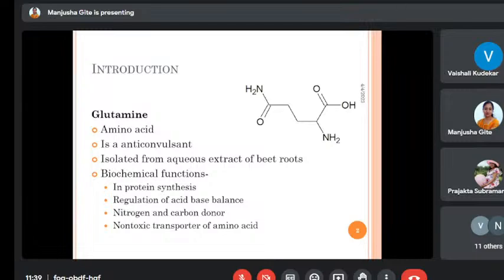In secondary amine, there is only one H, so you will get a singlet. In tertiary amine, there is no proton, so in this range, tertiary amine will not show you a peak. In the case of glutamine, you will get an NH2 doublet between this range, 3000 to... you always talk in terms of range only.